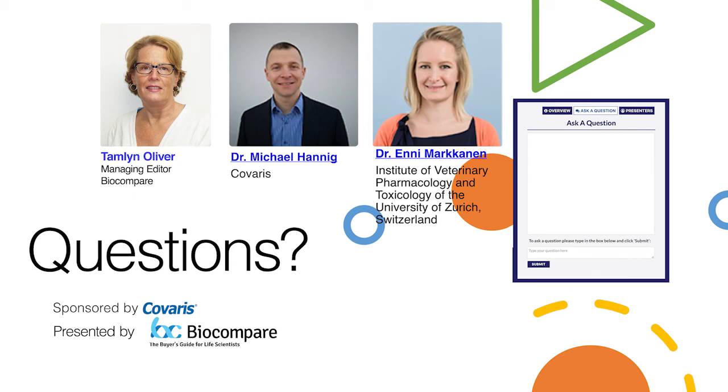So I think that's very important to really know what you're isolating at any given time. That's also why it's very important, I think, to include very well-trained pathologists in any of these workflows. Otherwise, you might end up isolating things which are just not what you would like to do.